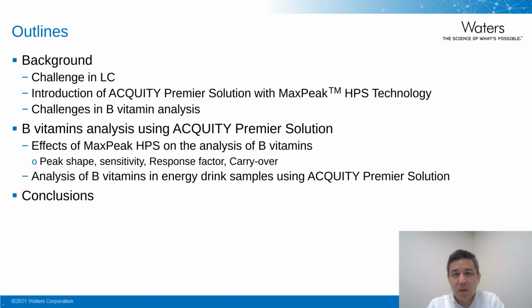I'll start with the challenges in LC analysis, basically why we developed this new technology and what technology is behind this. And also, we will talk a little bit about the challenges in B vitamins analysis. And then we will spend most of the time to show you what kind of benefit this new technology can bring you in the B vitamins analysis before we conclude.